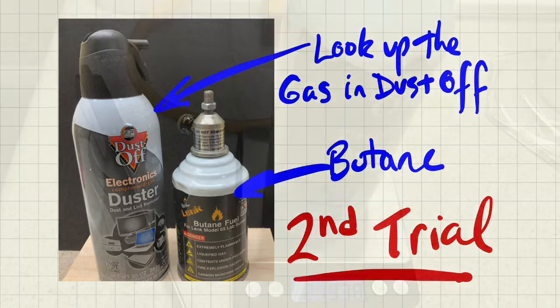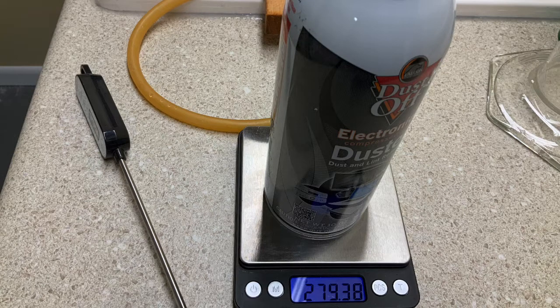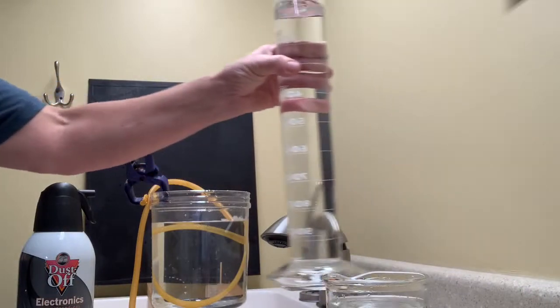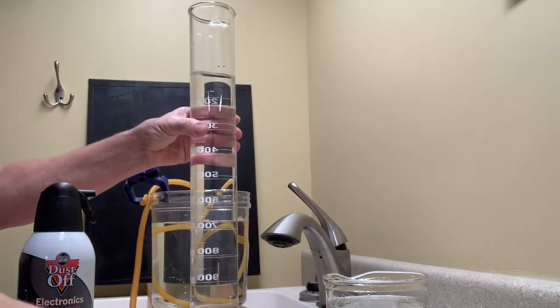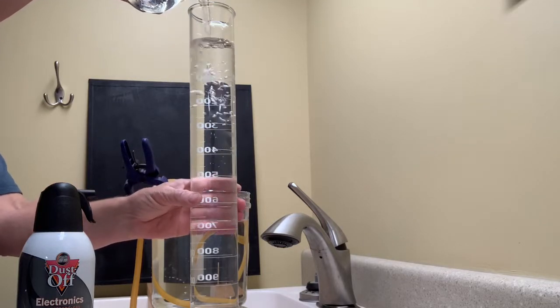Here comes the gas canister. A quick google search will let you know what gas is most likely in a dust off canister. This time we'll collect quite a bit more gas. So I'm going to use a 1,000 mil graduated cylinder.